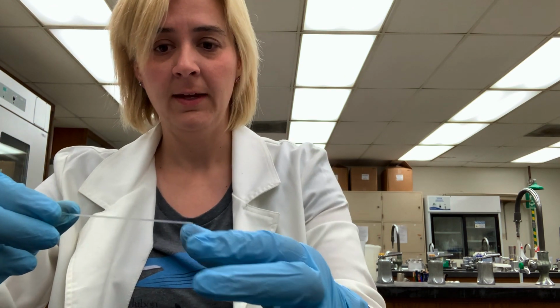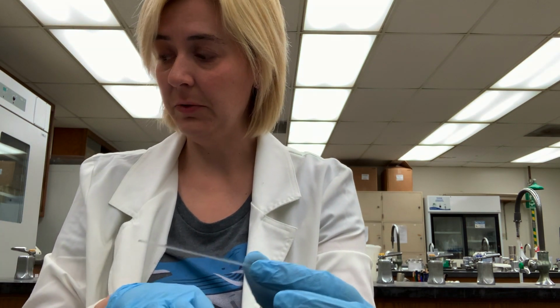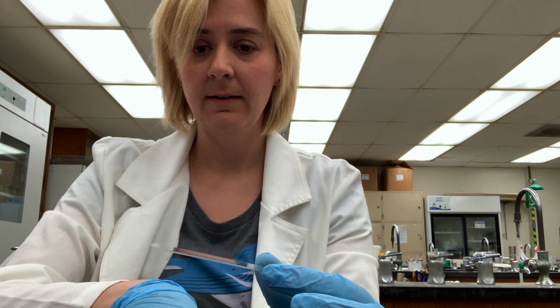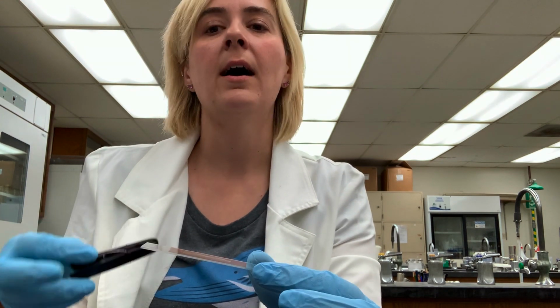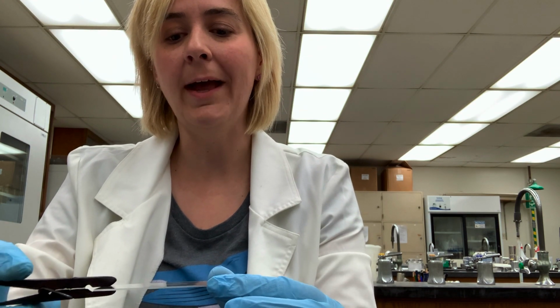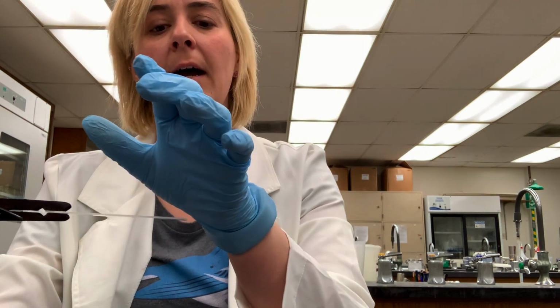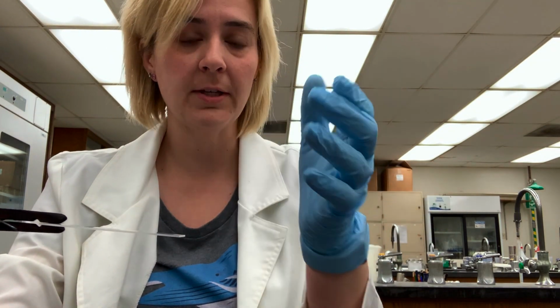And now I've got my original smear, which was from my liquid culture of E. coli. I know it's really hard to see, but it looks pretty dry. So our next step is to heat fix the cells. That kills the cells, unfortunately, but it also helps them adhere to the slide, because we're going to be adding stains and water, and those can wash the cells away. So by heat fixing, we help attach our cells.